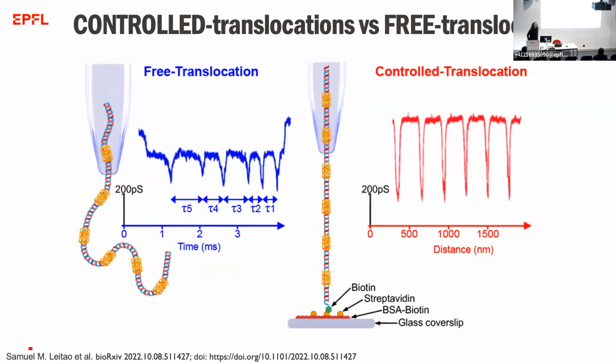But coming to the question of how much we can push the resolution and increase it. For that, I contacted a collaborator who actually introduced these dumbbells as a ruler for benchmarking nanocapillaries and solid-state nanopores in terms of the signal-to-noise ratio, and asked him to perform an experiment in which we would benchmark our system.